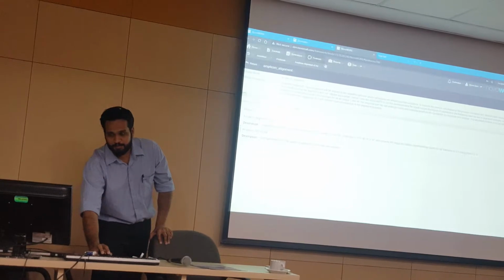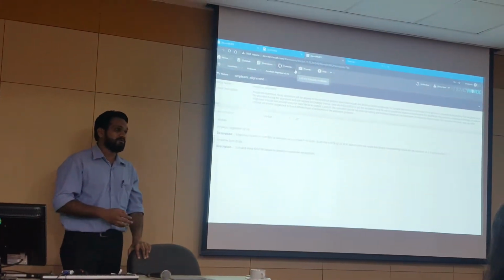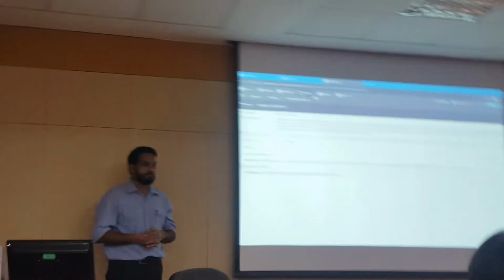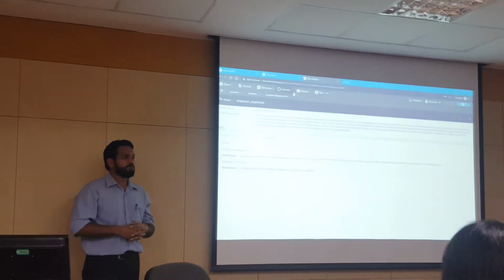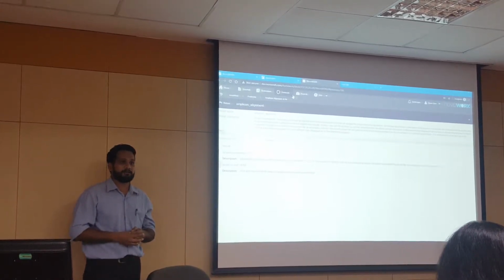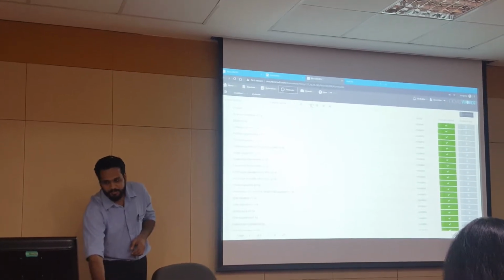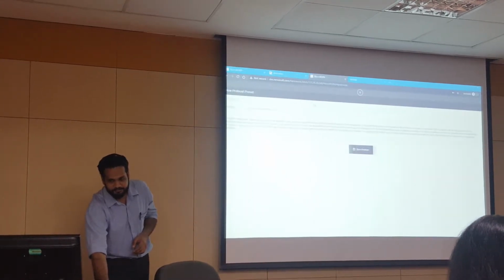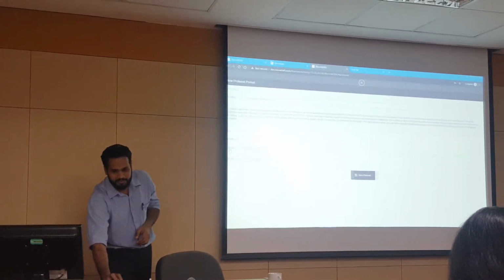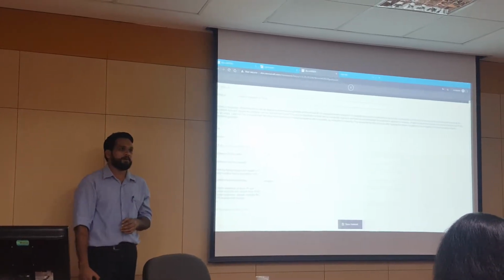So if you want to run your protocol, sometimes you want to optimize your parameters by yourself. We've already done the optimization of the parameters, so we've chosen the best default parameters for you based on our testing. But if you want to change the parameters for yourself and use it over and over again to run your project reproducibly, you go to protocols, you click on create new protocol, you choose the protocol that you want to edit, and under each individual module, you will have the parameters that are attached to this module.